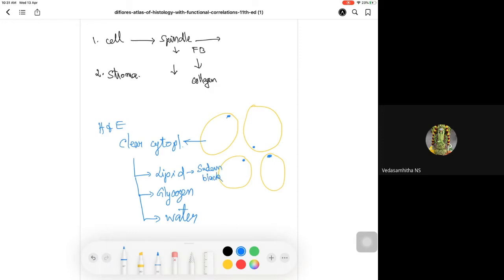You all know what the processing is now, isn't it? When you process the tissue, all the lipid will be dissolved. That's why you are seeing it, because they are not there. There is another interesting point. Some things you see because they are there. Some things you see because they are not there. Lipid is one best example.